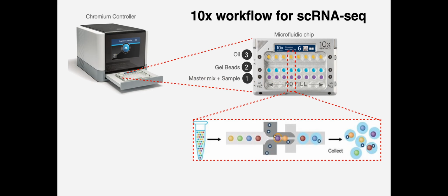And as that combination of cells and bead and master mix occurs, they pass through a perpendicular flow of oil that you had loaded here.